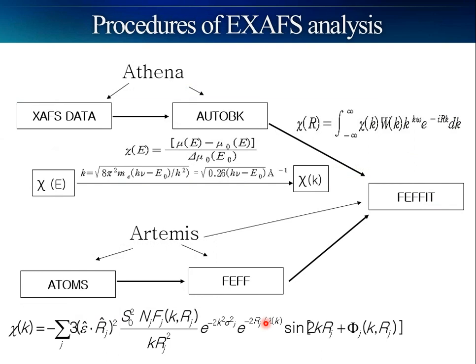Now, I would like to tell you about the procedure of EXAFS analysis. We will use the Demeter software, which is based on the IFEFFIT software, when we analyze XAFS. When you download Demeter and install it, you can get the Athena program and the Artemis program. Athena is the program to remove the background and to analyze the EXAFS spectra. Artemis is the program to fit data to a model.